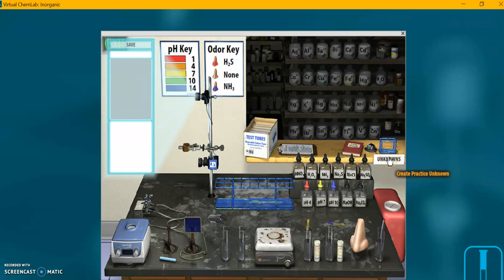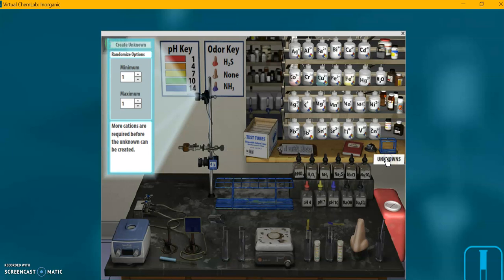And now the little hand appears, and you can create a practice unknown. So I'm going to click on the unknowns. And now we see we have activity here. All these things are live options again.